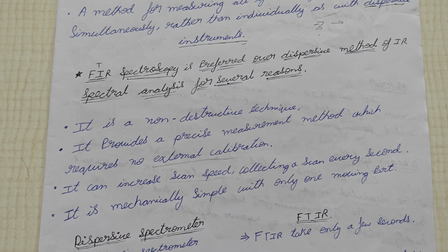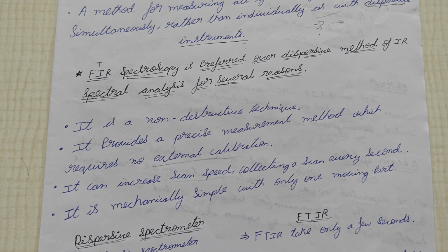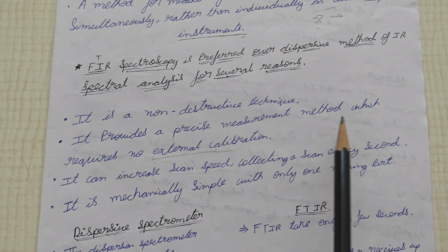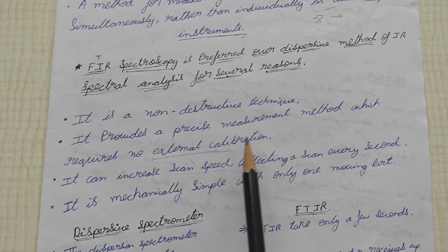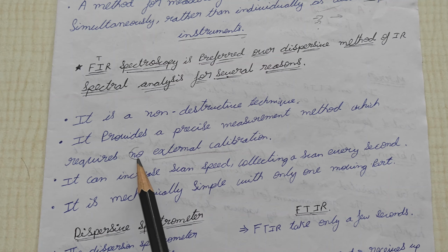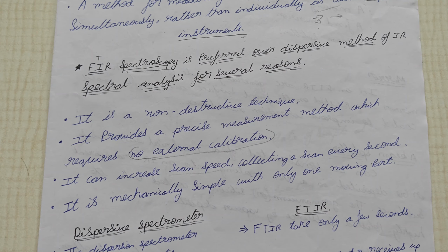Firstly, it is a non-destructive technique. Here the sample is not destroyed, it is just analyzed, but in other methods it is destroyed. It provides a precise measurement method which requires no external calibration. In this method there is no requirement of external calculations, because all the values will be directly displayed on the readout devices.